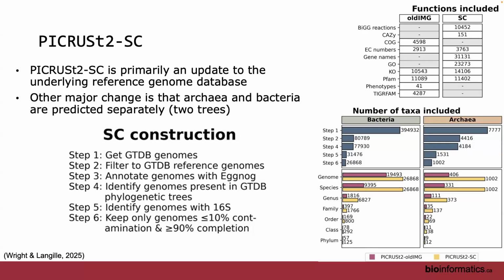And so archaea sequences are put into an archaea tree, and bacteria sequences are put into a bacteria tree. And then it's just combined afterwards. So you don't see that per se, but it is an important mention. And then basically Robin obtained genomes from GTDB.